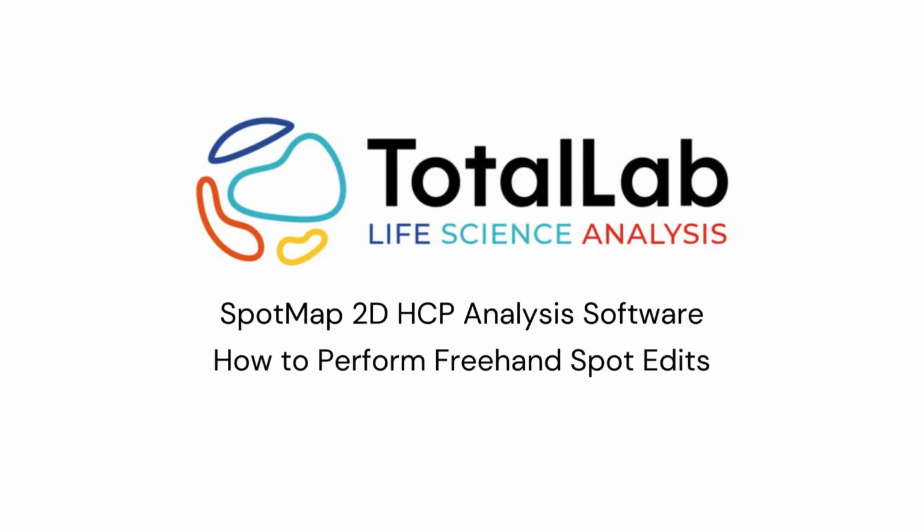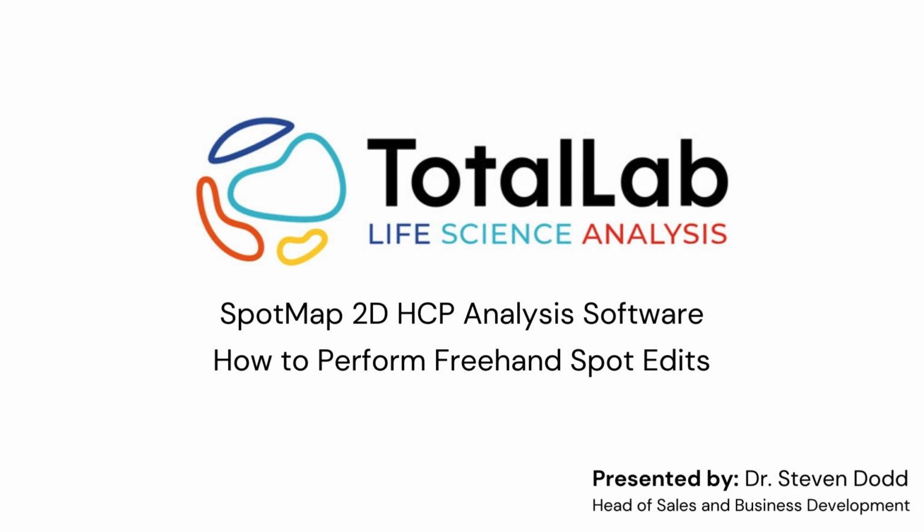Hello everyone. So today I'm going to be guiding you through the manual freehand tool that we've got built into our SpotMap software to allow for manual spot addition, splitting and merging.